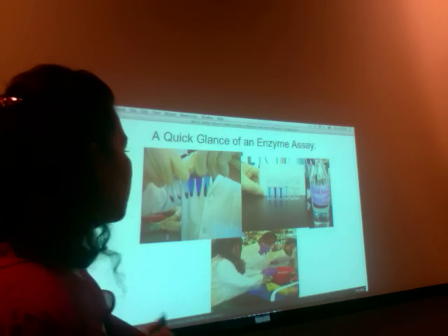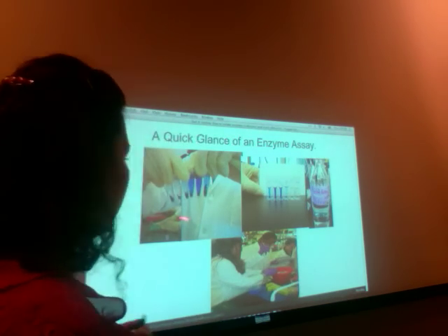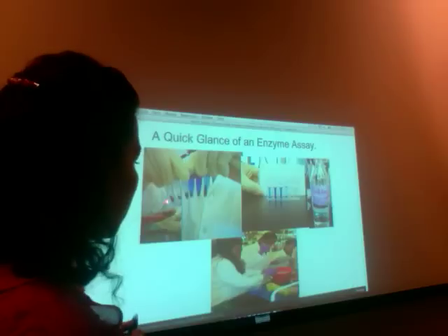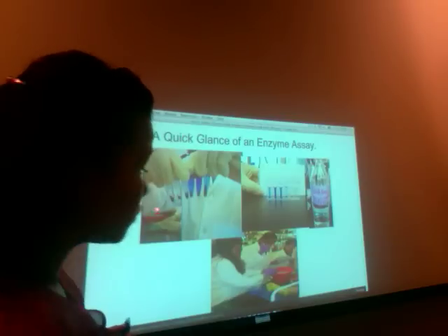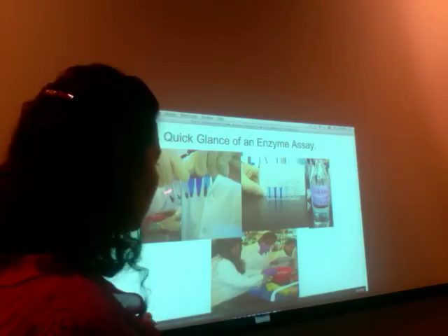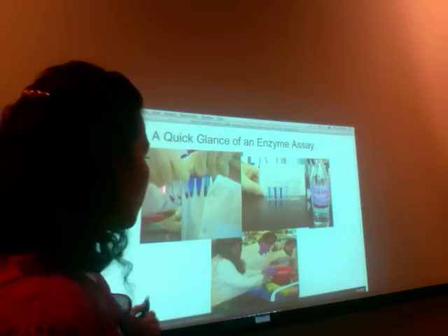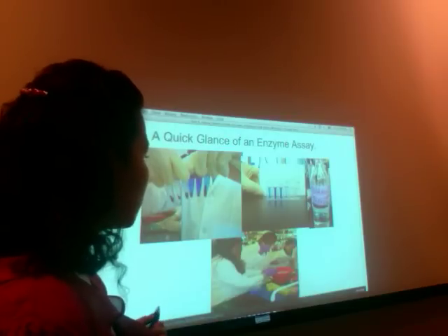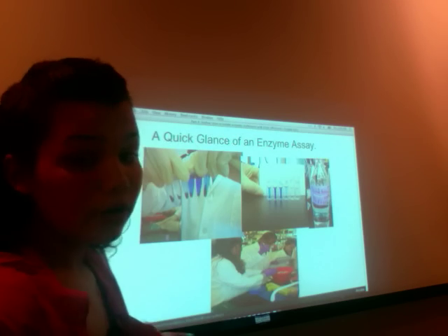We measured this by color depth. We can see the enzyme is doing its job if the blue dye shows more. Notice how the cellulose is right here because it's dyed blue. Cellulose is insoluble, but when the enzymes cut it, the monomers float up into the solution and it becomes soluble. We notice this by color. The darker it is, the better.